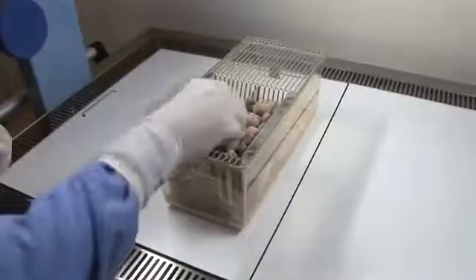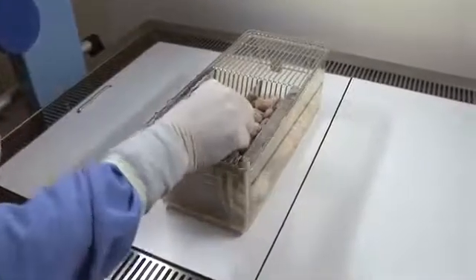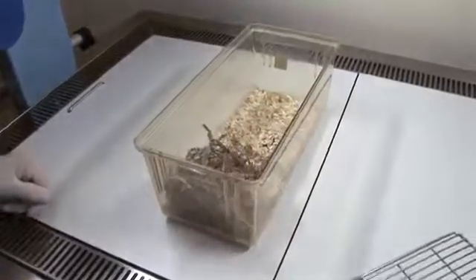The cage lid should be removed carefully to avoid excessive disturbance to the animals. The mice should be allowed sufficient time to become aware of your presence.